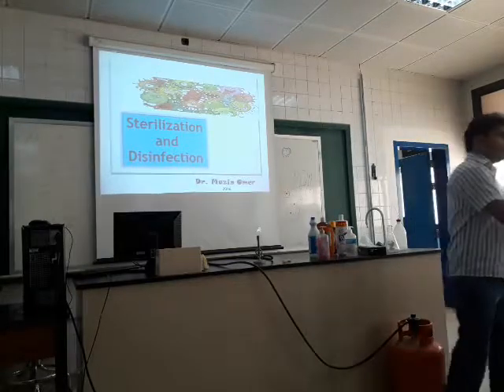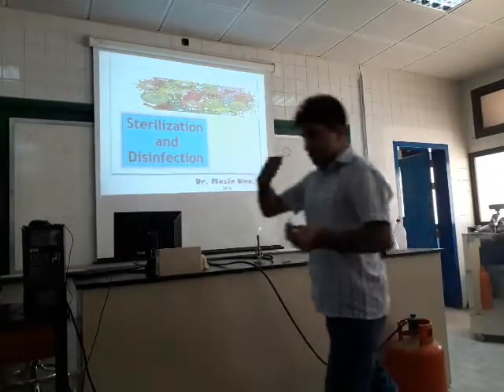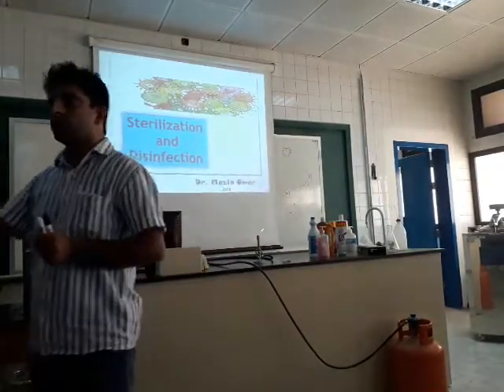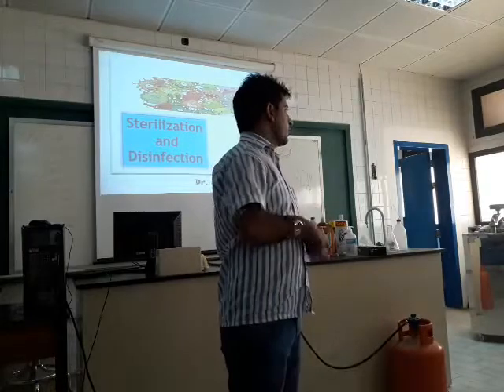During an operation, the doctors need scissors and forceps, which must be free from microorganisms. Catheters used for the patient should be free from microorganisms.